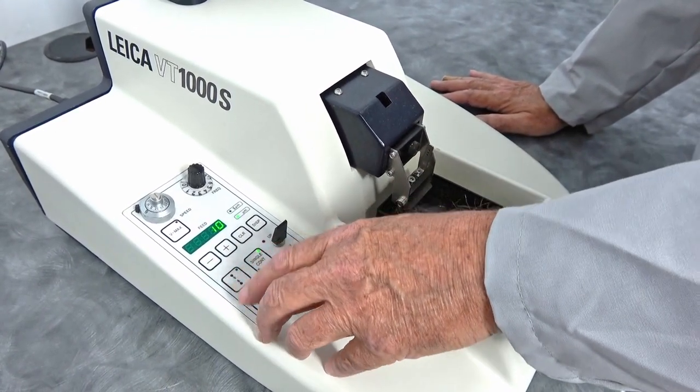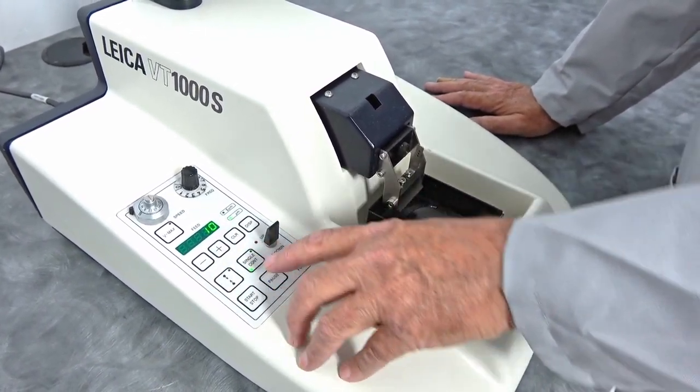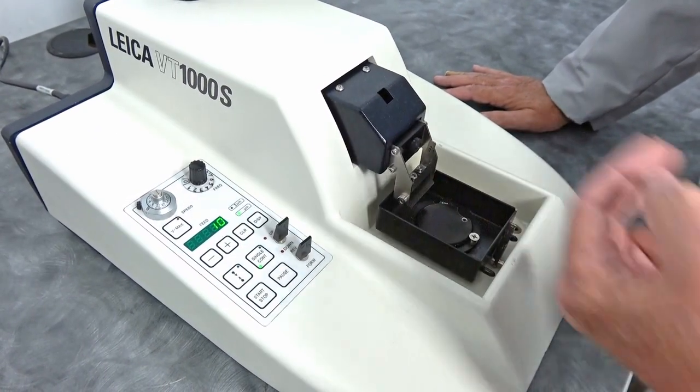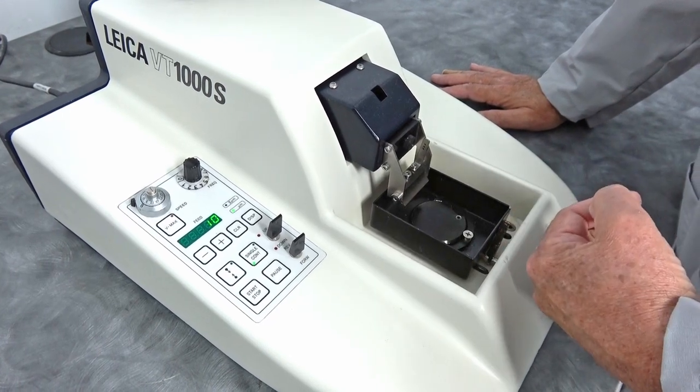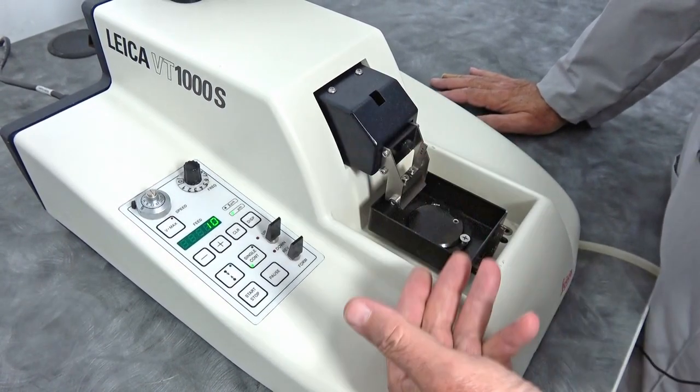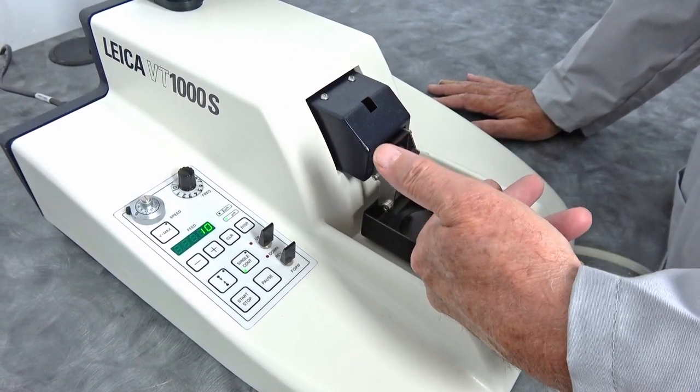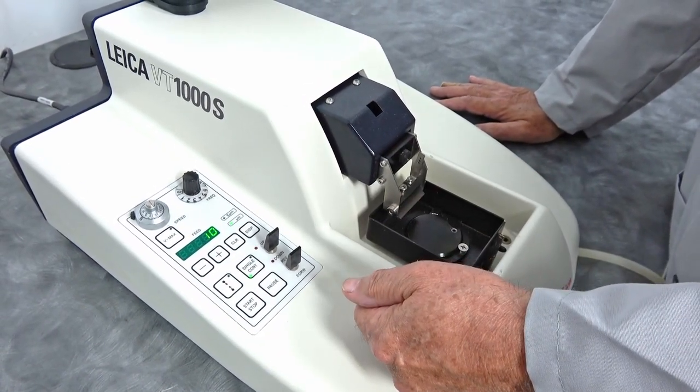You can also do a continuous feed, which is the second push of the button. And then it will keep cutting that sample each time raising the sample up to meet the new cutting surface.